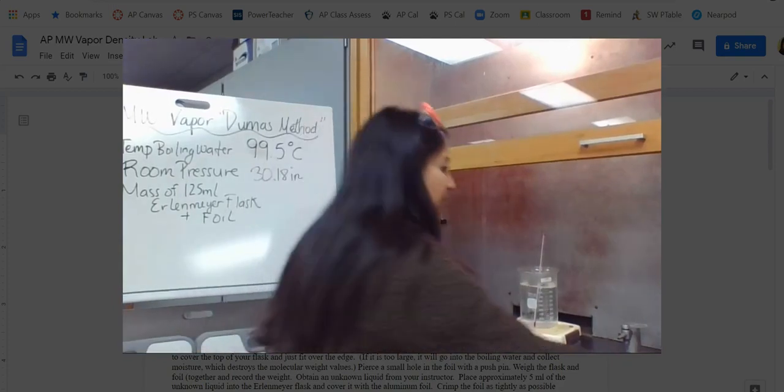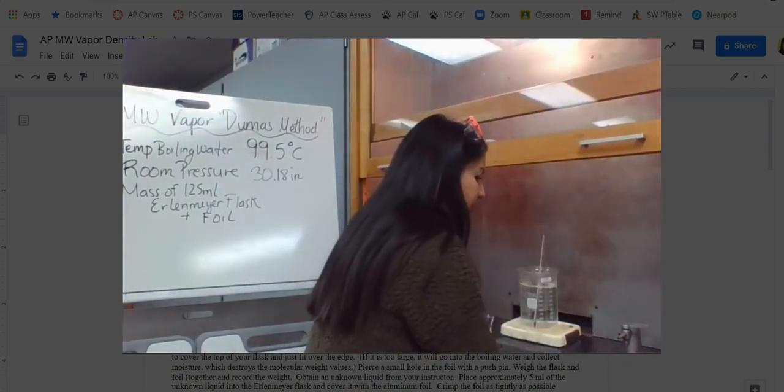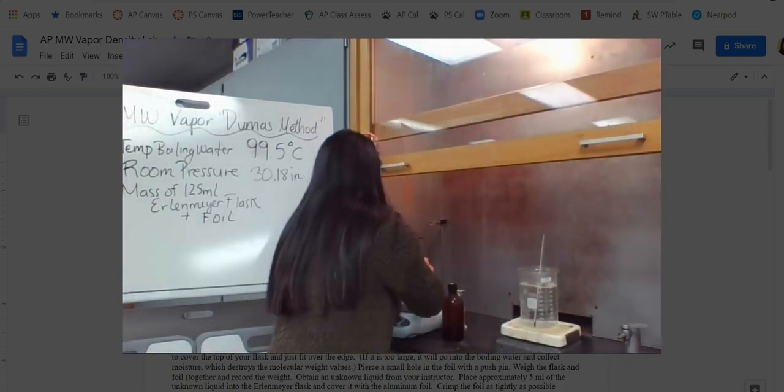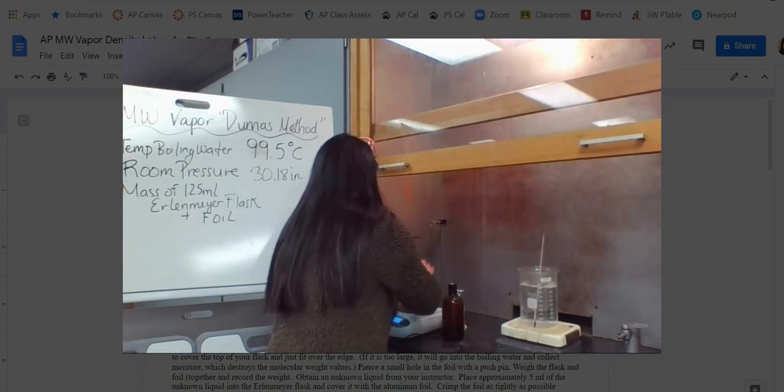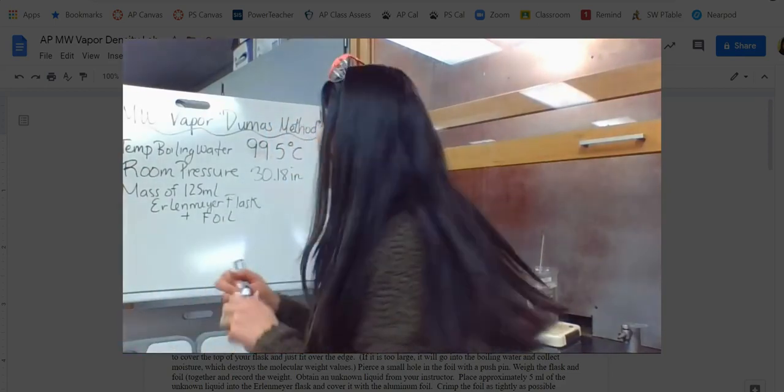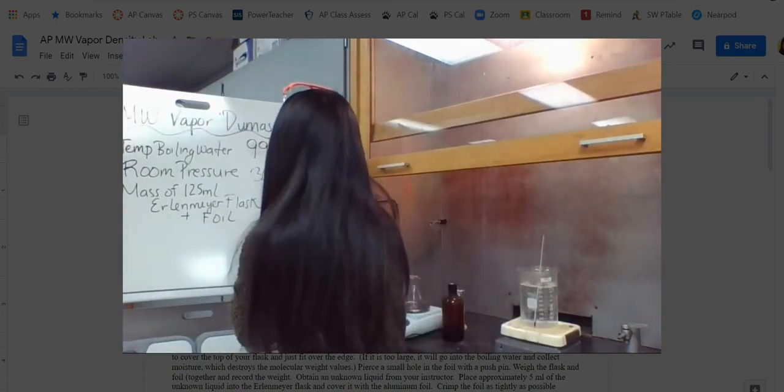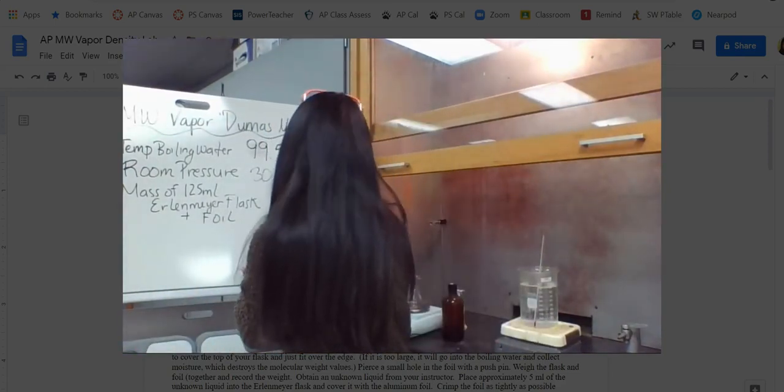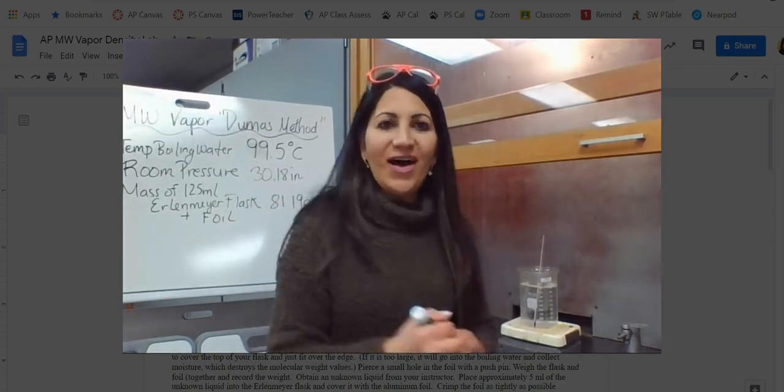Let's weigh the 125 milliliter flask along with the foil. And so I'm just going to put these together and it doesn't even have to be covered or anything. And we're looking like 81.19 grams. 81.19 grams.